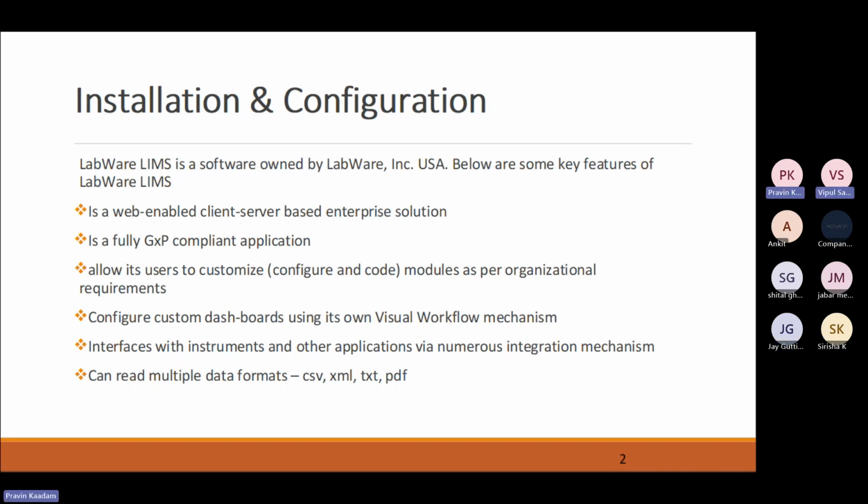Is it the same as GMP? Because I have heard of GMP, good manufacturing practices, or 21 CFR Part 11, widely used in pharmaceutical companies. What he said, electronic signatures, audit trails, etc., is that the same term GXP? So there is GMP, which stands for good manufacturing practice. There is GLP, which stands for good laboratory practices. GXP covers both.